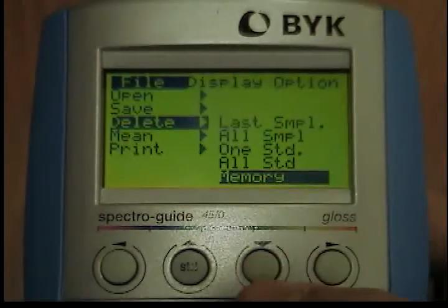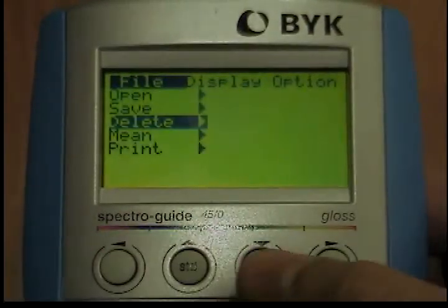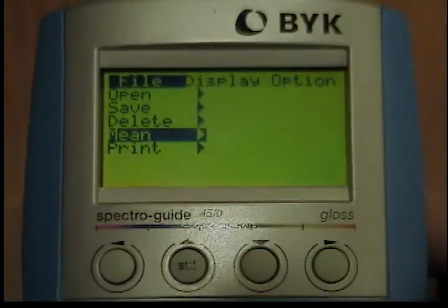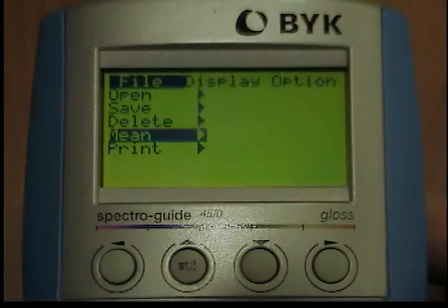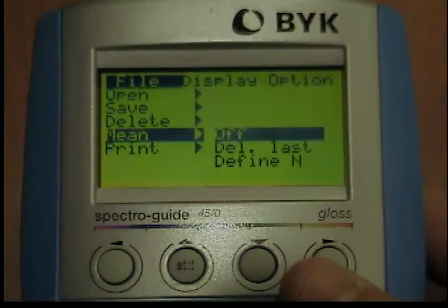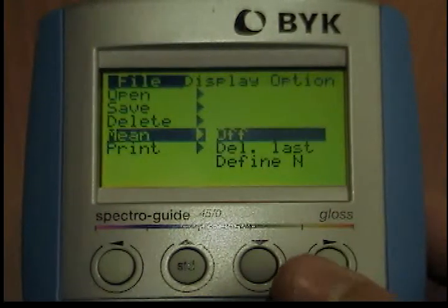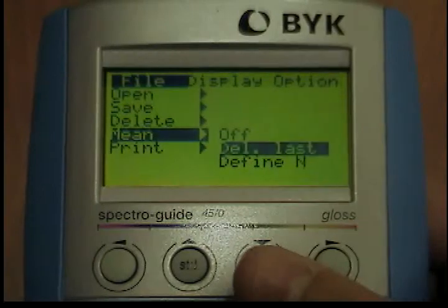File Mean: the Mean submenu, which can be found selected from the File menu, contains the following options: On, Delete Last, and Define End. These options are described previously.